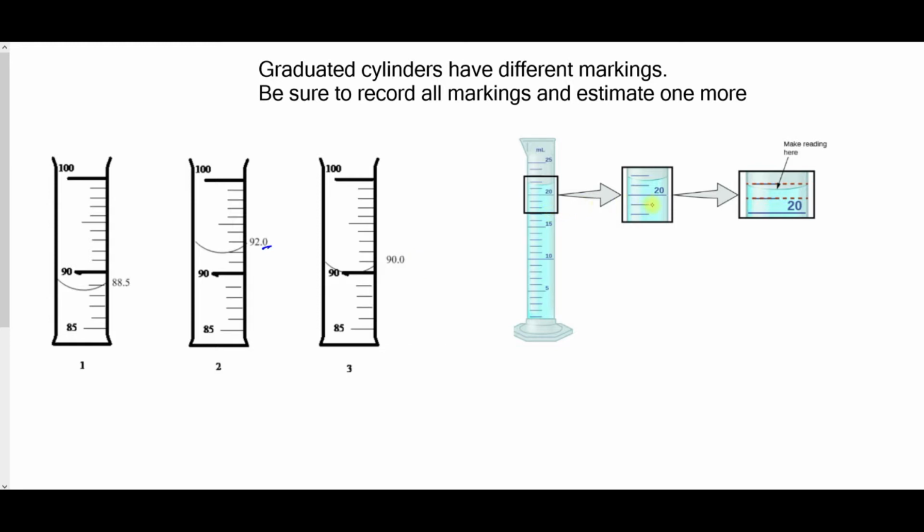If we look, we know that it is above 20, and if we count, each one of the markings is a ones place, so we're above 21, and I say that's about 6/10 of the way between, so I would make it 0.6. The estimated value is going to vary depending on how you look at it and from person to person.